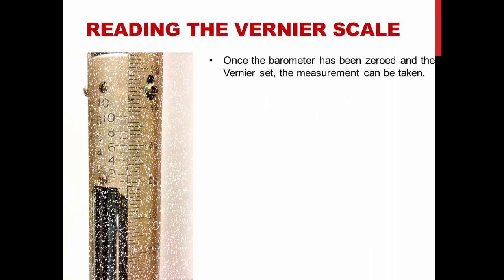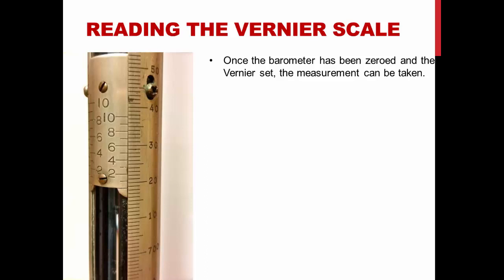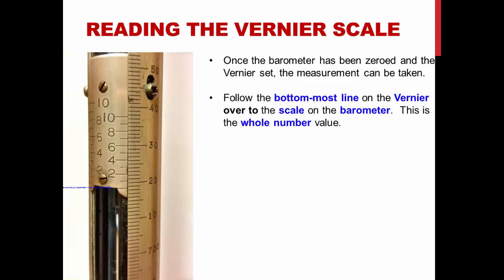Once the barometer has been zeroed and the vernier set, the measurement can be taken. Follow the bottom-most line on the vernier over to the scale on the barometer. This is the whole number value.